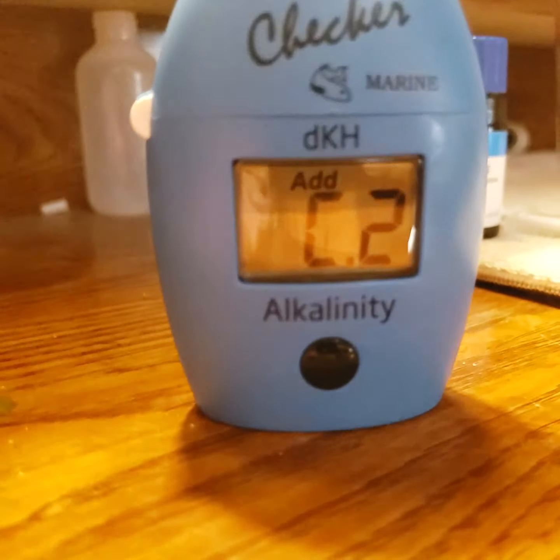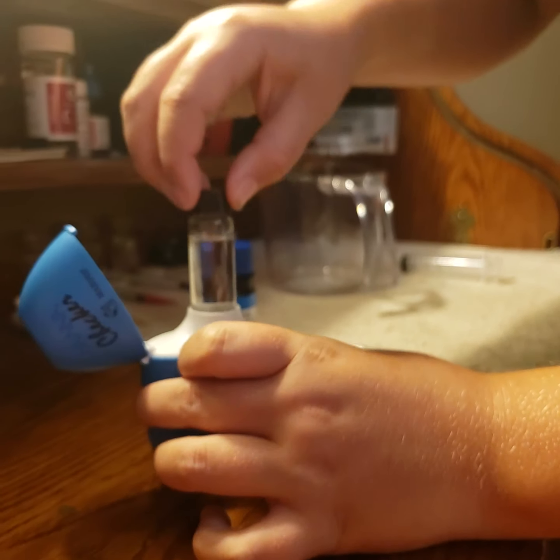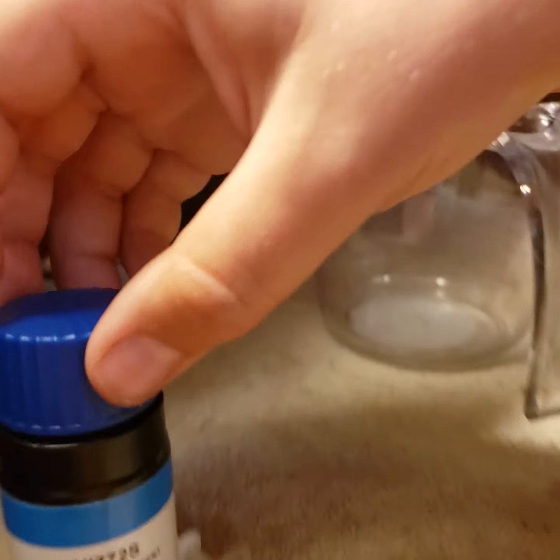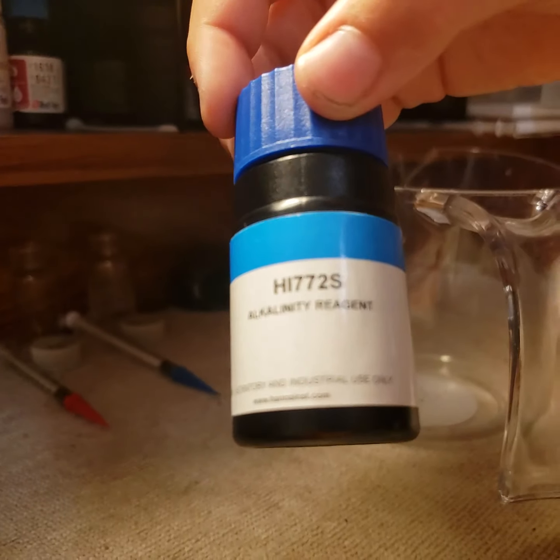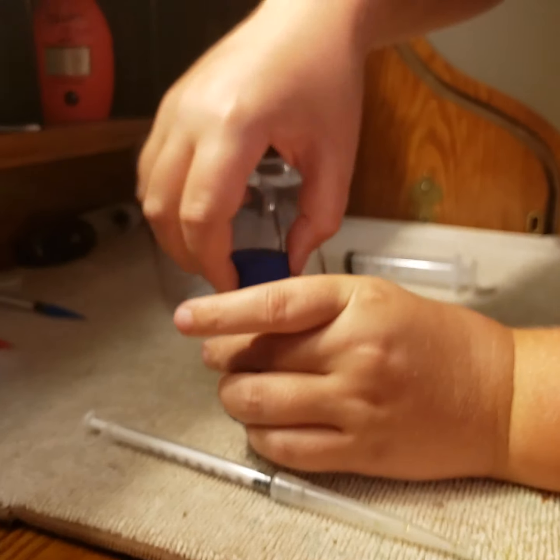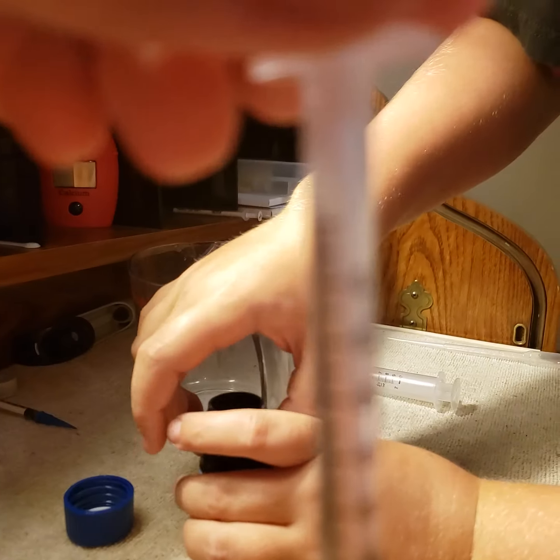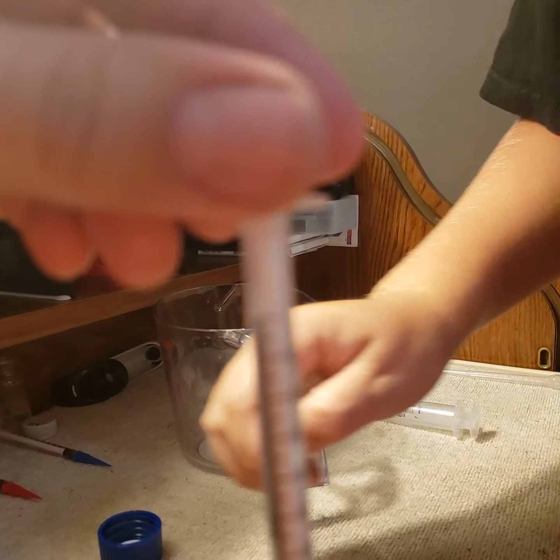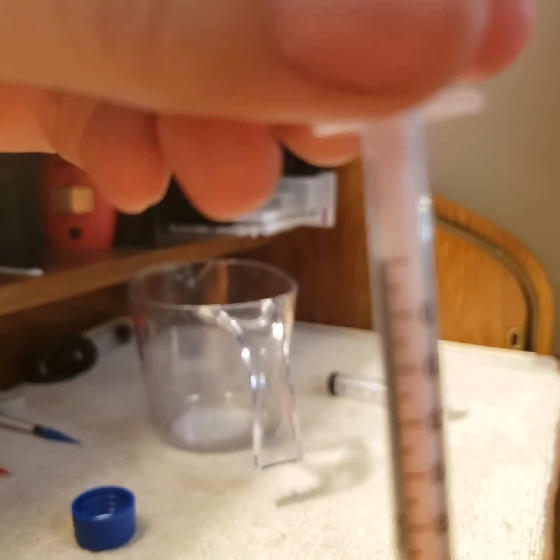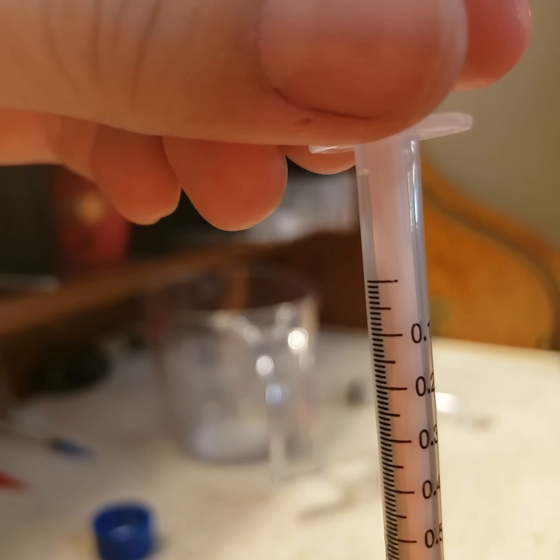Now it says add, so he's going to remove the container, set it on the table, and he's going to measure out from this container with the blue label using this syringe. He's going to measure out until the bottom of the syringe comes up to, trying to get my focus here. It's not focusing on it, darn it. To that top line. There we go. See that top line? The bottom of the syringe is going to line up with that top line.